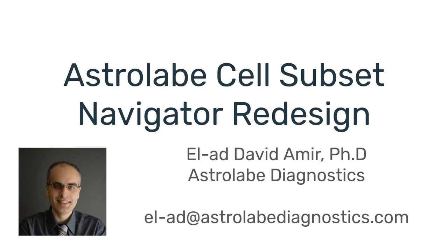The Cell Subset Navigator is the tool that takes all of that information, all of these hypotheses, all of these ideas, and puts them in one place so you can readily and effectively scroll between them and pick the ones that are most relevant, most interesting, and really promote your research the most.